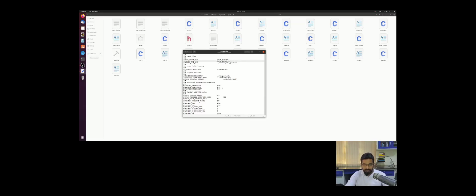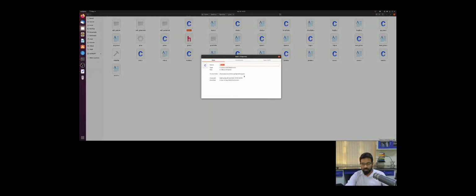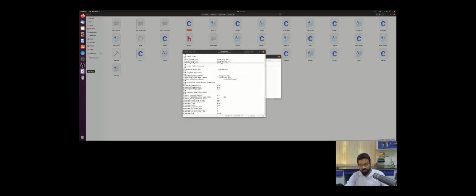So all these files I have inside the folder called grow. Let me check what the path for this folder is. I copy this location of the grow folder, go to the editor, and paste the location. Inside the grow folder I have 4dfr grow, and 4dfr pocket.txt. Inside the grow folder I have all the 3 input files, right?